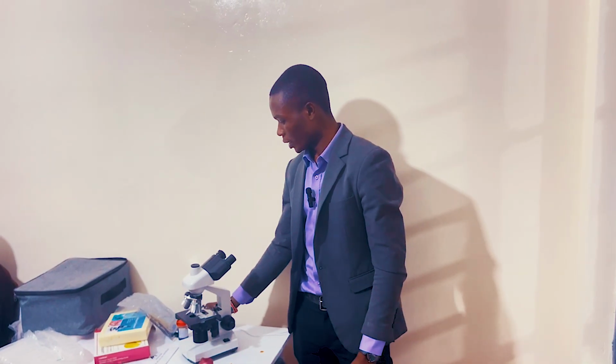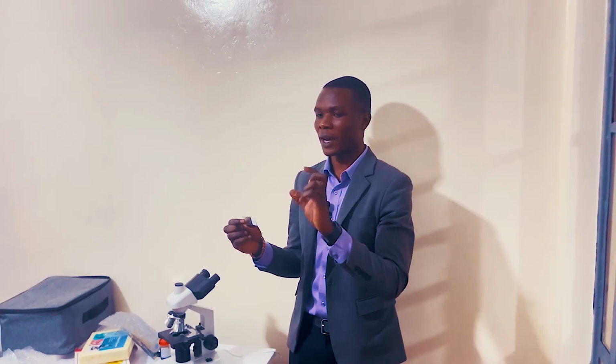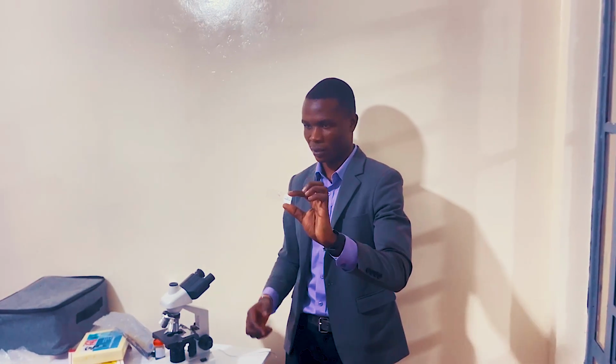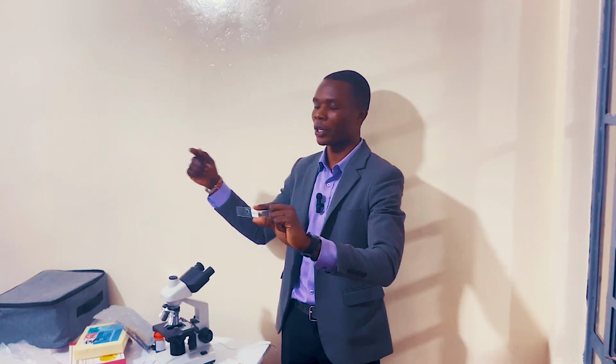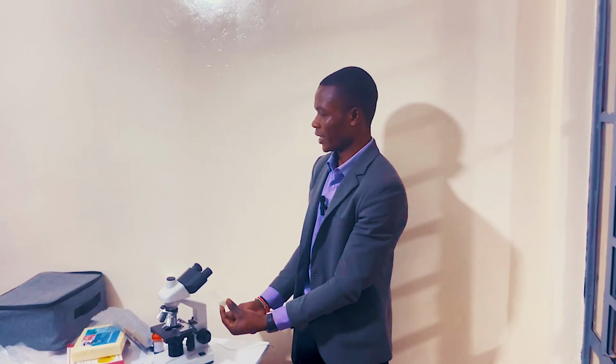There is another thing I've learned with this one. If you look at these slides, they are labeled. They have different labels, so it means they have already made the specimens. For example, this one is a stomach section, this is for animals. If you want to view a stomach section of an animal, it's already in the slide. So you're not going to look for it from an animal and then bring it. It is here. So what you're going to do is just to view it. They have made our work very easy. Are we together up to there?